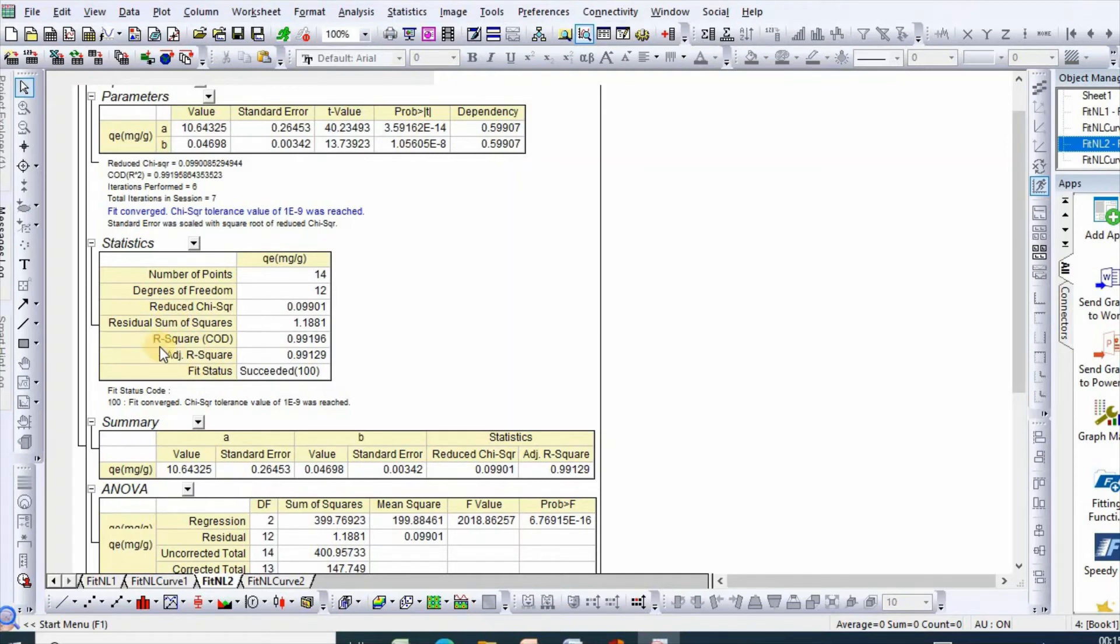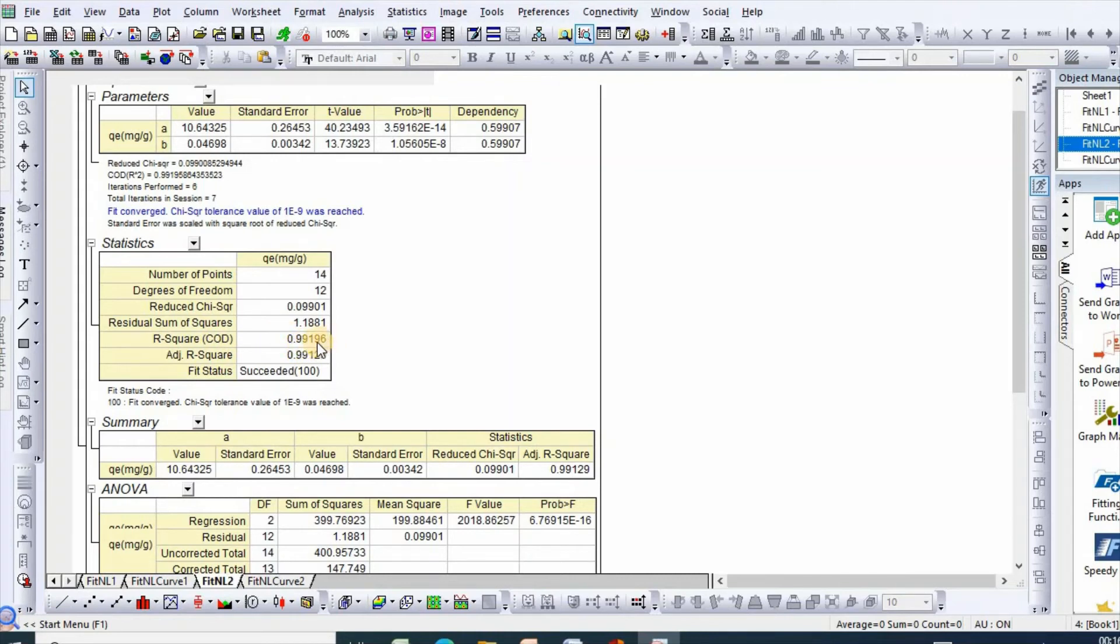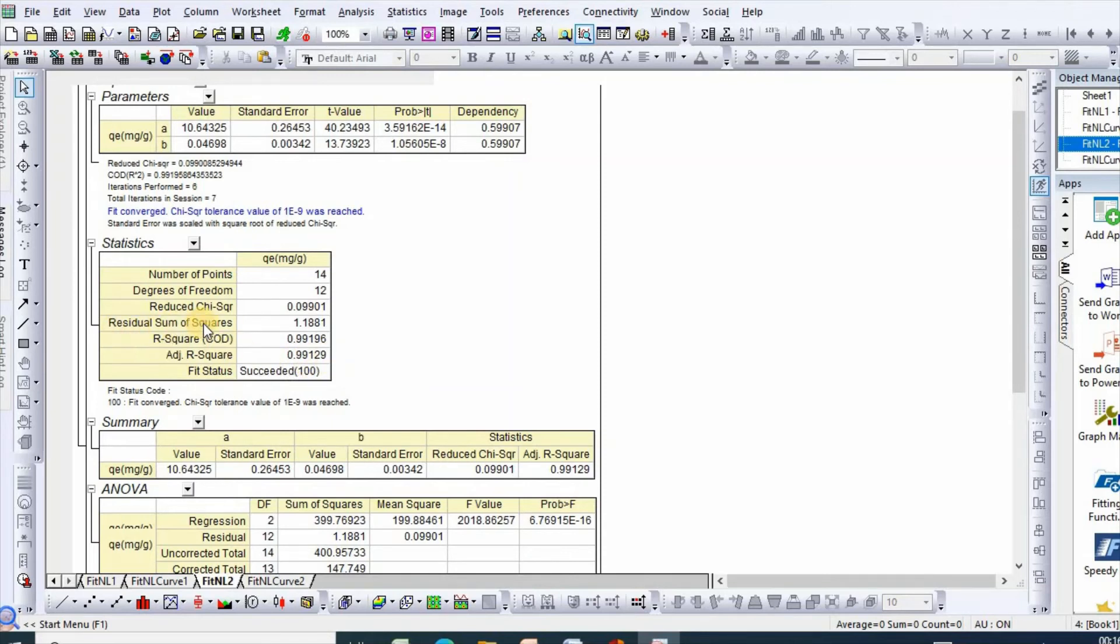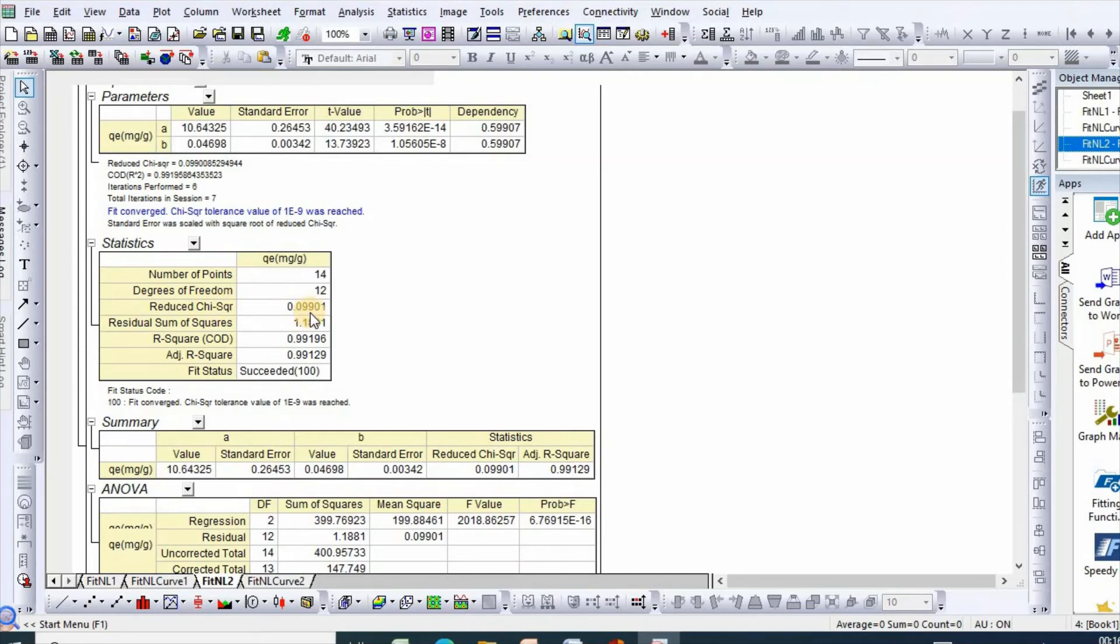Number one is R square, which is the coefficient of determination, which is 0.99196. Then adjusted R squared is 0.99129. Then residual sum of squares is 1.18, and reduced chi square is 0.099.